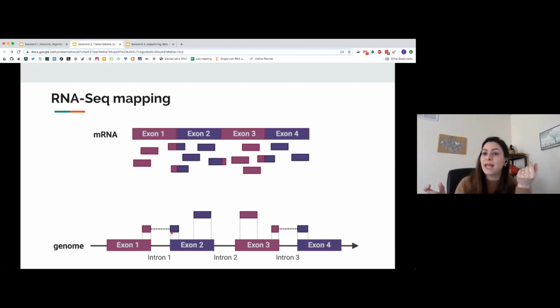And the reason we use splicing aware aligners is that, first of all, they know the most likely positions of exons in the genome because you gave it the reference annotation for that genome if you have one. And they try to align the most that they can of a section of a read. And when they can't anymore, they will look for the remaining section in the whole genome in case it's a novel splicing junction that's not annotated. But if it is an annotated splicing junction, they already have the positions where it's more likely for that remaining piece of read to be, okay?